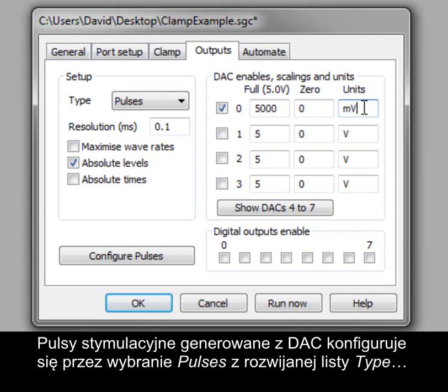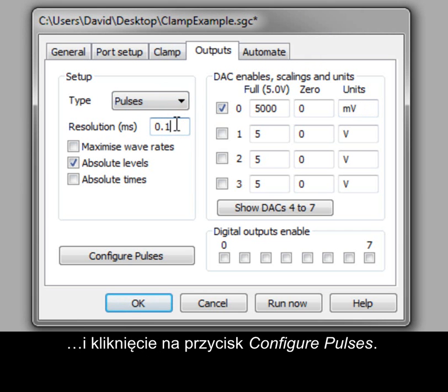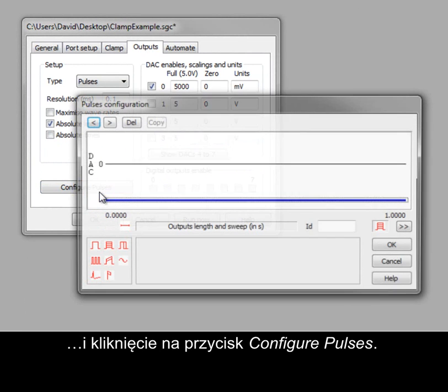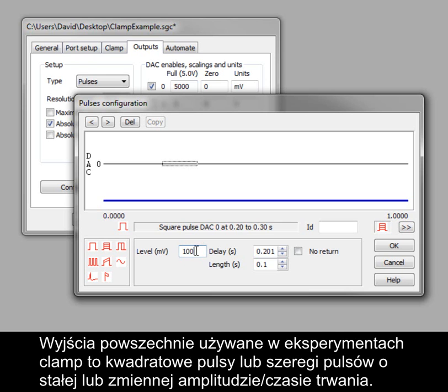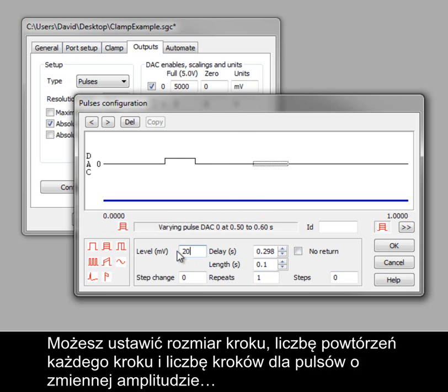The stimulus pulses to output from the DAC are configured by selecting Pulses in the Type drop-down list and then clicking the Configure Pulses button. Output types generally used for clamp experiments are constant or varying amplitude or duration square pulses and square pulse trains. You can set step size, number of repeats for each step, and number of steps for varying amplitude pulses.